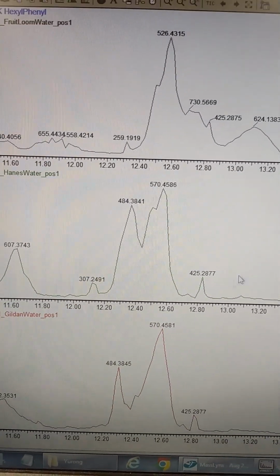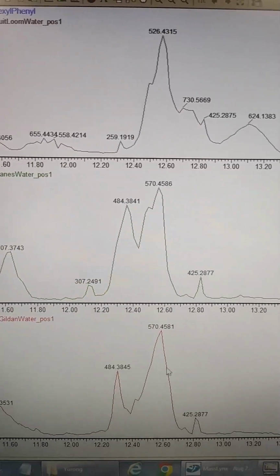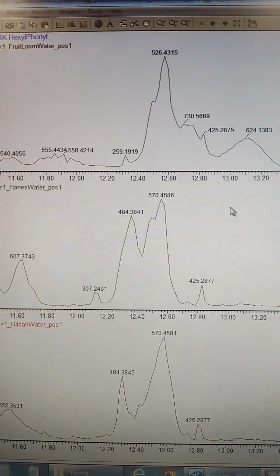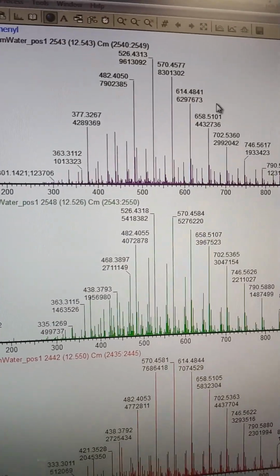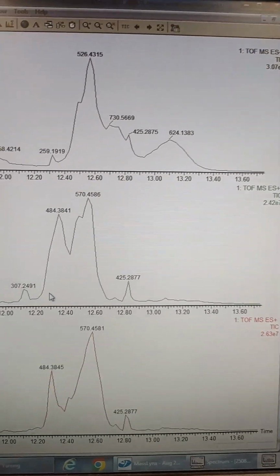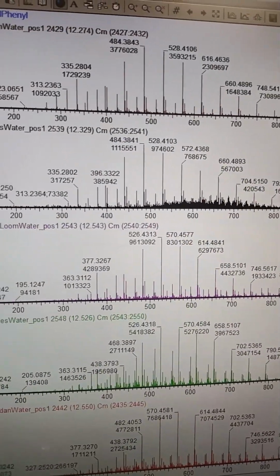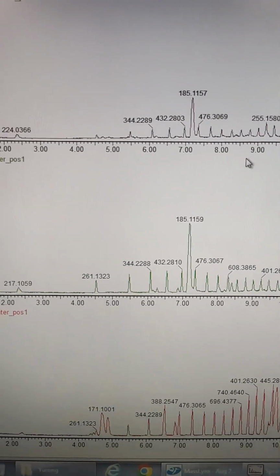The last thing is that we got this big mass, super nonpolar, out at the very end. And this is coming out at 570. Again, it's a big polymer blob. And if we're gonna look at intensities on this one, it looks like the Hanes shirt is again kind of the lowest on intensity, but it's tough. It's a tough call. So all the stuff late are different kinds of polymer additives that are probably used in manufacturing.